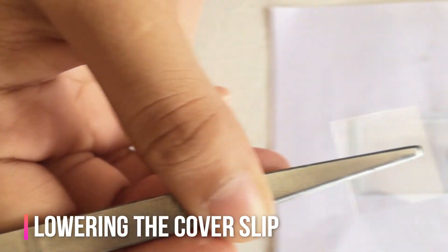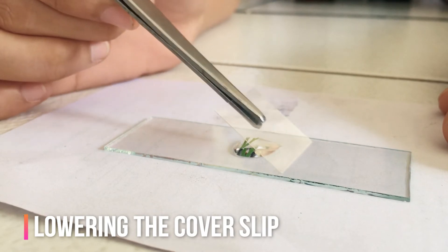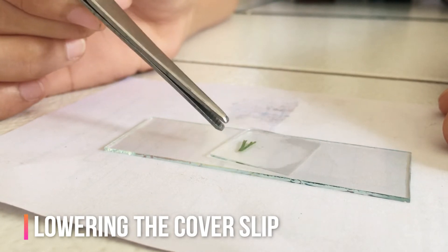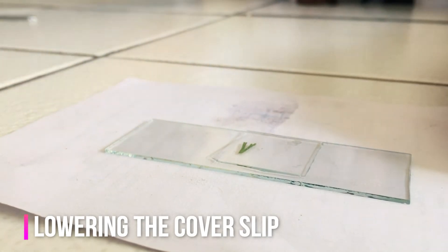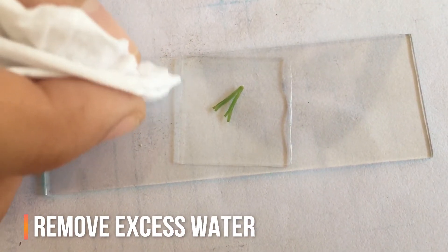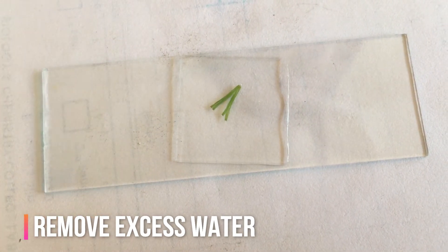Carefully lower the cover glass so that it touches one side of the drop of water. The cover slip should form an angle of about 45 degrees with the slide. Lastly, remove excess water with a filter paper or tissue paper.